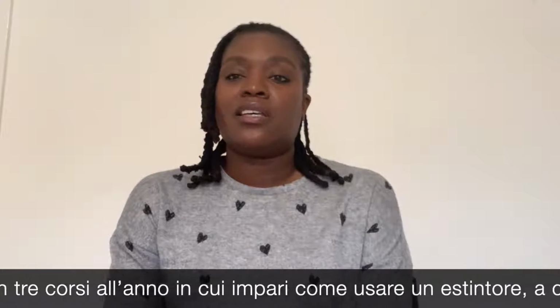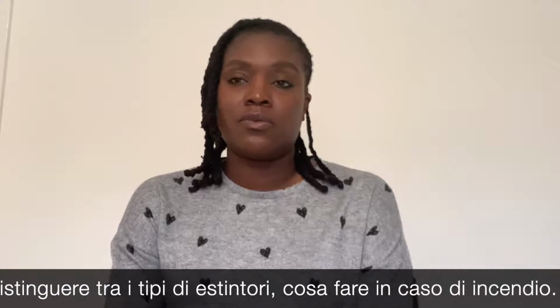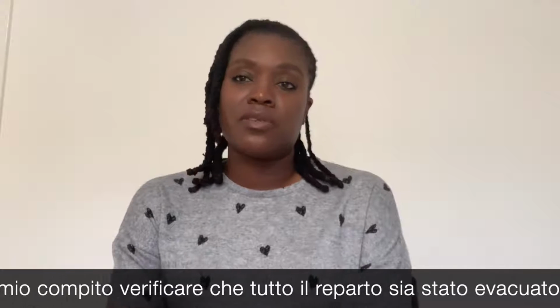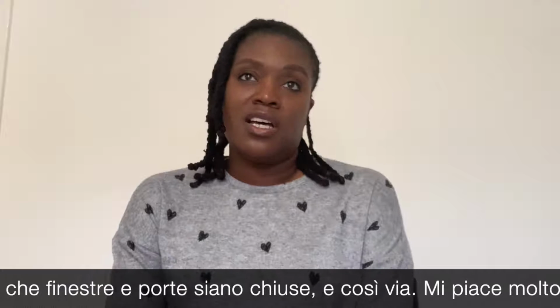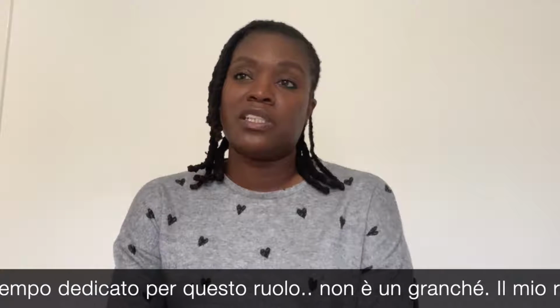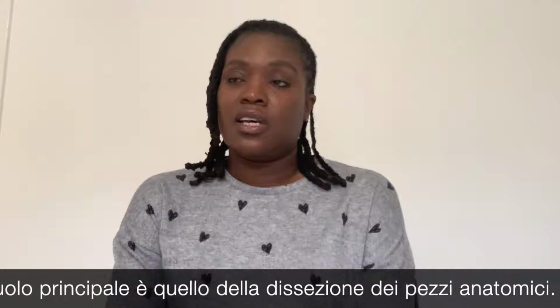So I keep up to date with 3 yearly courses with the fire marshal, so learning how to use the fire extinguisher, the different types of extinguishers, what to do if there is a fire. If we have a fire alarm that goes off in the department, it's my role to make sure that the whole department is evacuated, windows and doors are closed, etc.